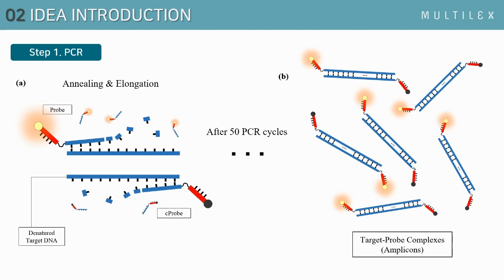As previously said, the Megaplex probe set has a forward primer and a reverse primer, and they each bind to the target single strand, which is denatured from double-strand form. This process is the same as conventional PCR, so you can gain amplified targets, which are called amplicons.